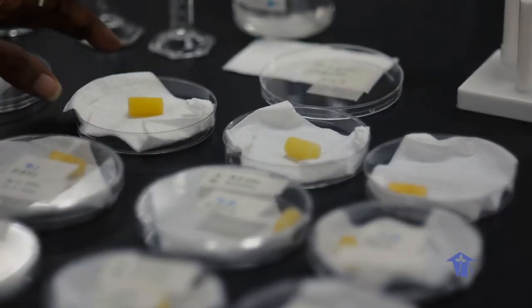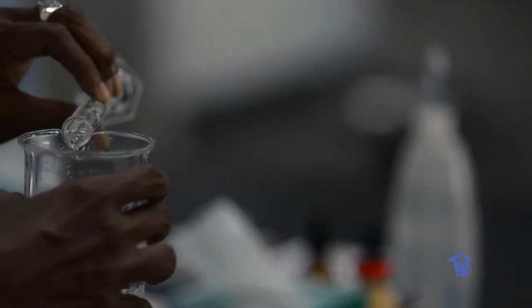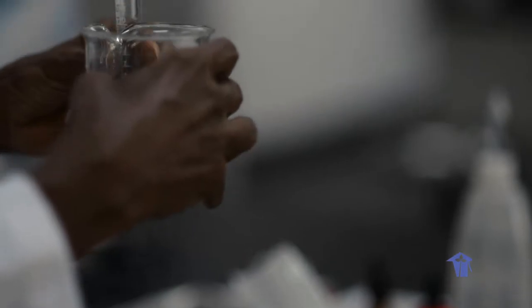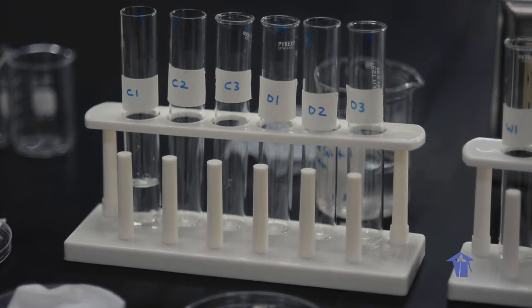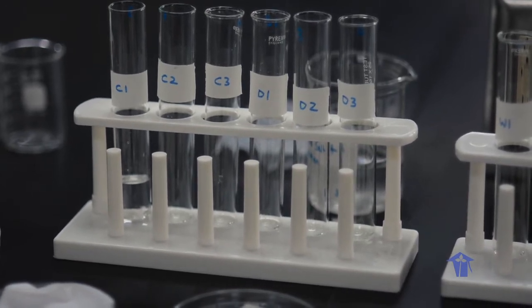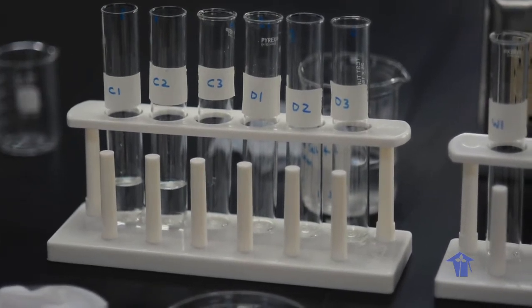So we're going to do this setup for the concentrated solution by pouring approximately 10 mils of this into each of our boiling tubes. Use the meniscus to ensure that we are getting the same volume into each of our tubes.